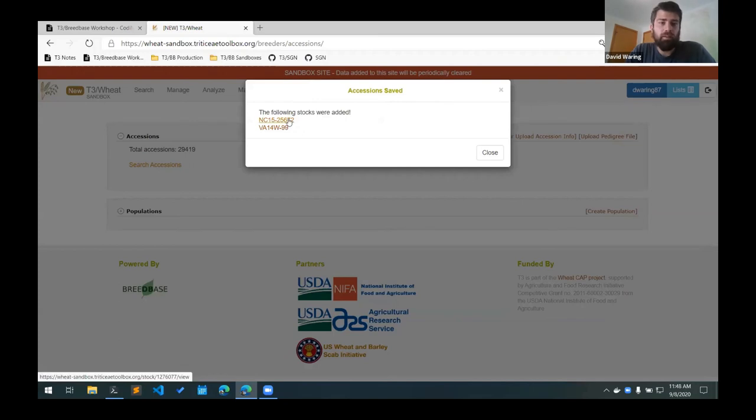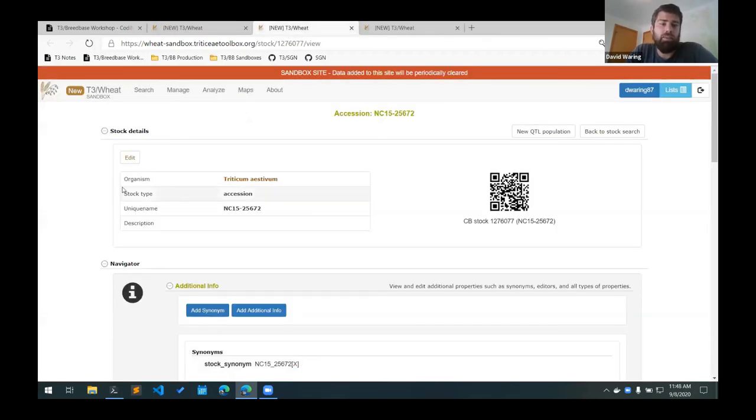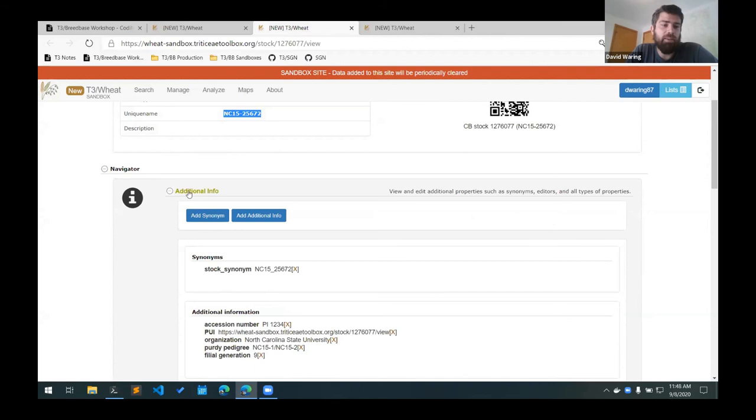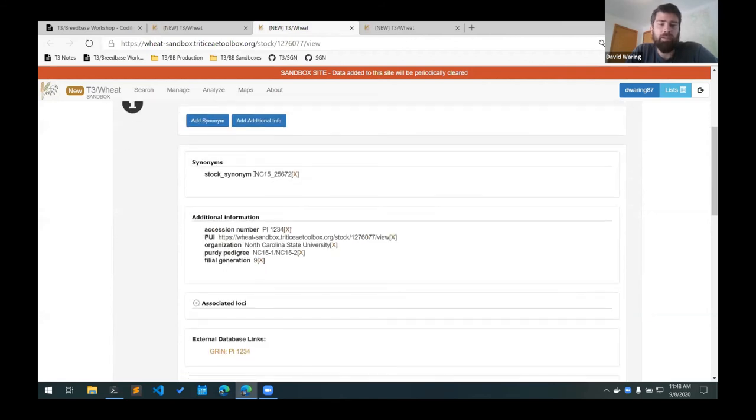And then we can click these links here to see the details about the accessions. So we can see our name has been added here. And then our properties are in this additional info section here. So you can see the synonym that we added, the accession number that we added.